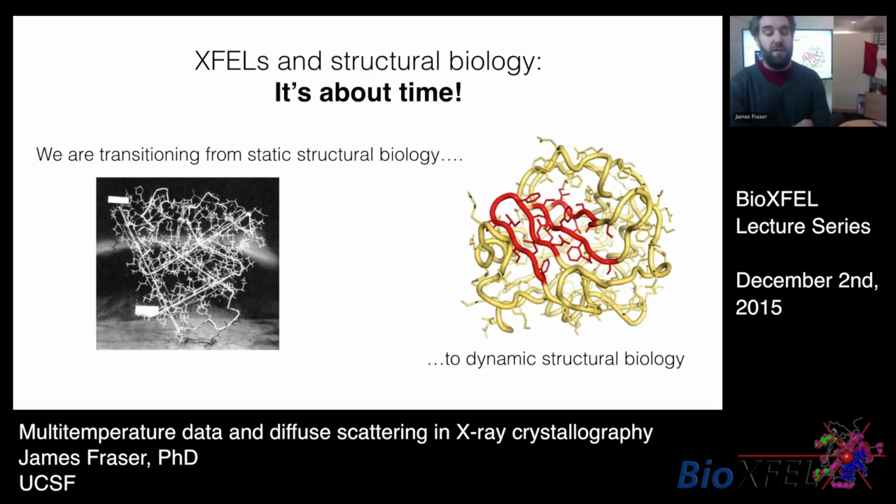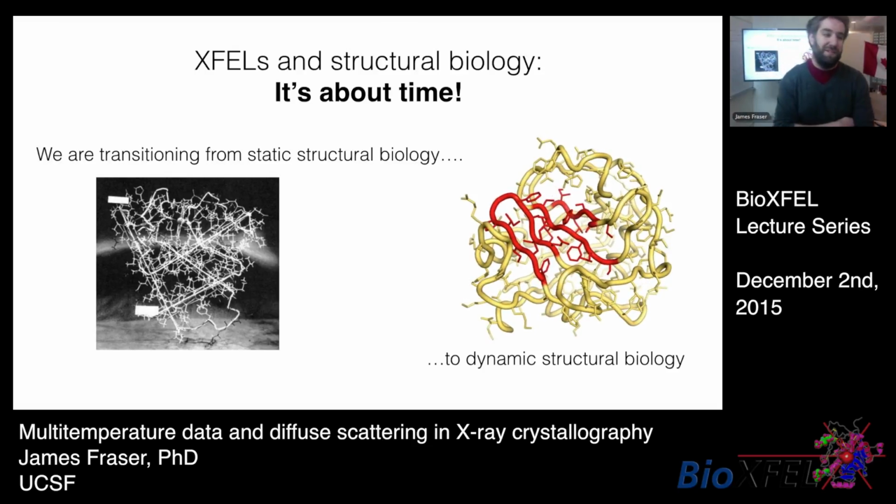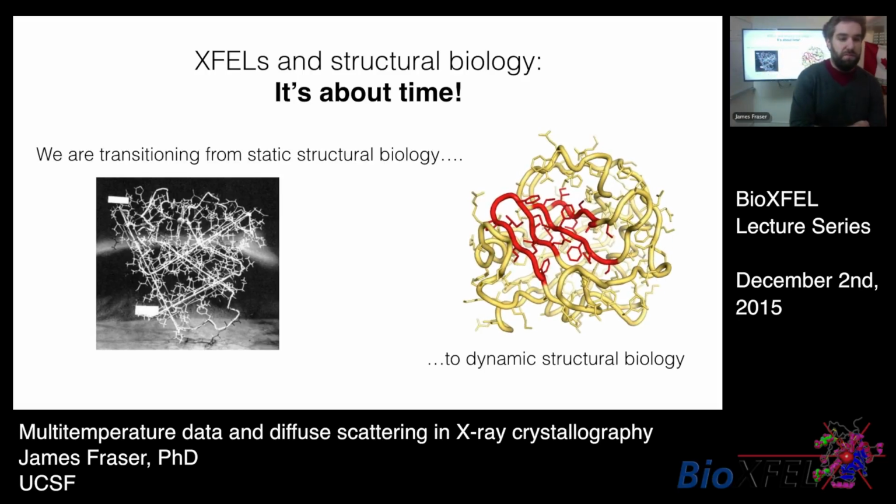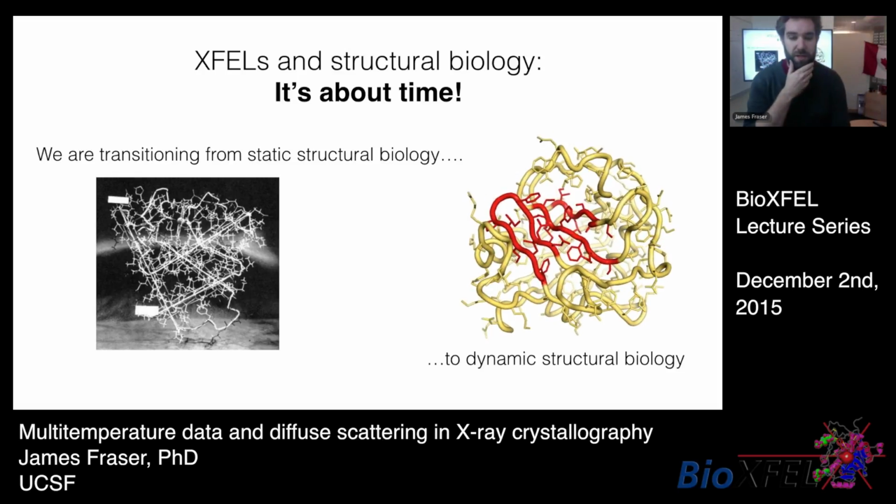One of the major challenges, though, is that not all systems are so conveniently wired as photoactive yellow protein or carboxymyoglobin, where there's an easy and accessible optical trigger to really begin our time-resolved investigations. And so we've been thinking a lot in our XFEL studies about using temperature as a global perturbation to help us initiate conformational sampling in the protein and then learn something new about the biological mechanism.